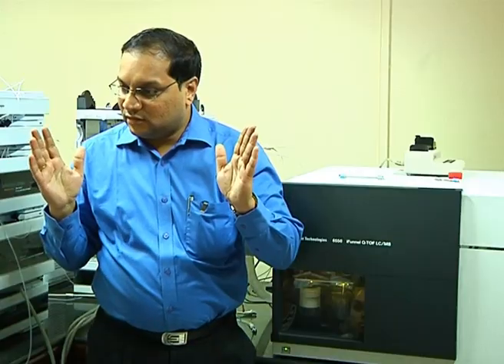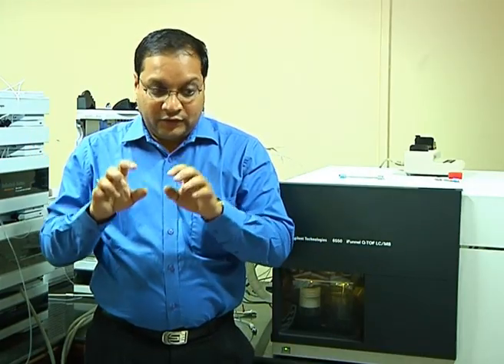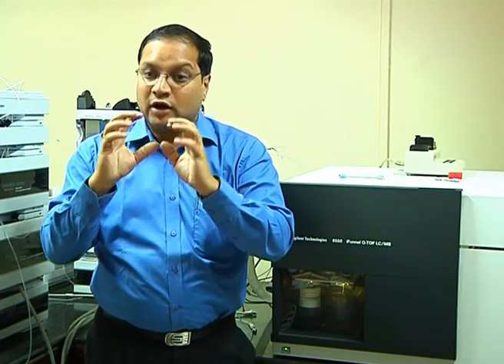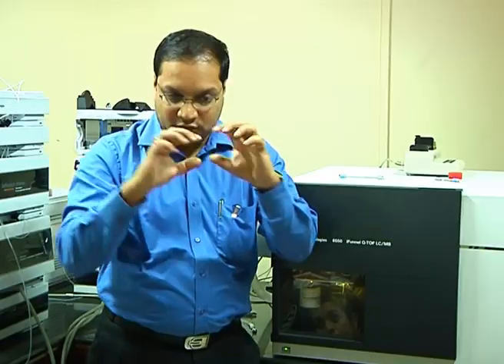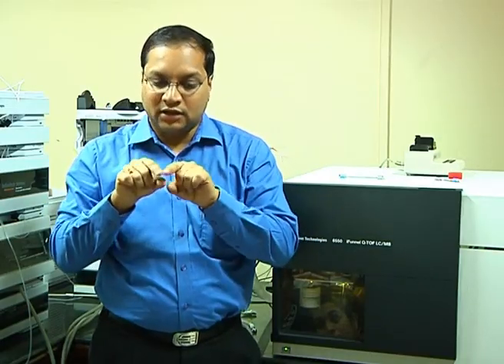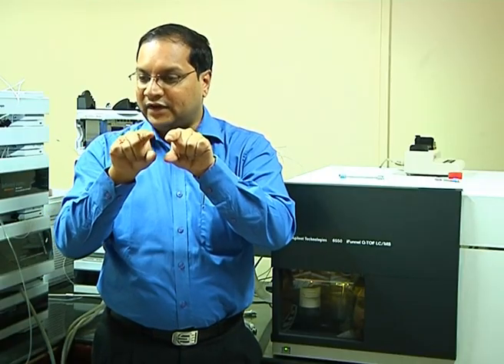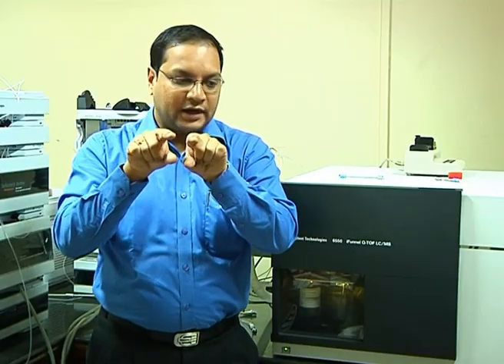It is also called a mass filter. Why? Because it has the ability to filter mass. If you say look for mass of 500, it will filter everything away and only allow 500 to get inside the quadrupole and travel through the four rods. How does it do that? These four rods are at different electronic states, like RF and DC voltage. For example, this rod and this rod, alternate rods, are in RF mode.